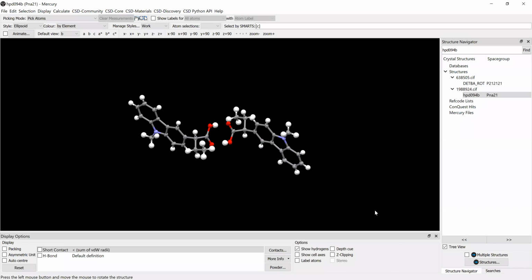But this space group here, if you haven't noticed yet, if you look over here on the right hand side, this is PNA2 sub 1. And again, like we mentioned yesterday, P means primitive cell. And we'll talk more about the centering later on. And you can see we have a 2 sub 1 here, so there's going to be a screw axis, because 2 sub 1 represents a screw axis.